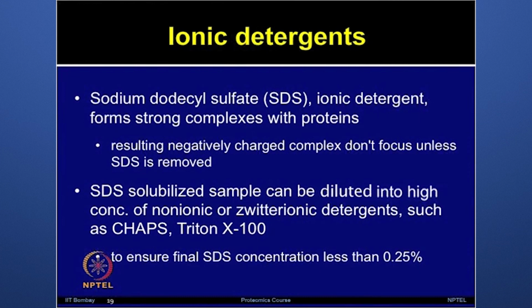However, if your aim later on is to perform protein separation using isoelectric focusing or other gel-based methods, it is going to create problems, because the SDS will bind to the proteins, resulting in a negatively charged complex, and that will not focus unless the SDS is removed from the protein sample mixture.